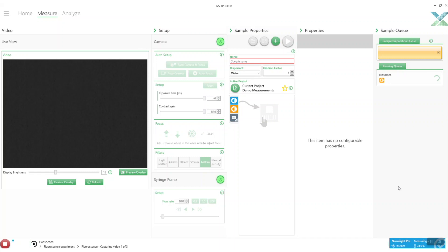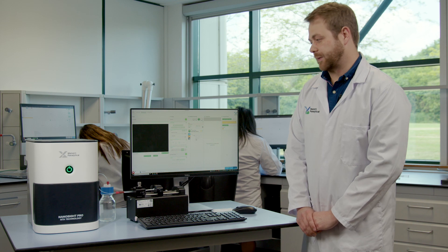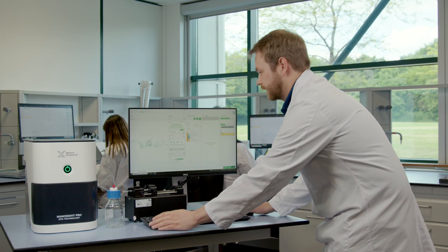Once these are both done the software automatically overlays those two parts of the measurement and makes it easy for the user. Now that measurement's finished, the processing will be happening in the background and what that means is we can either look at other data in the software that we've measured before or we can run a different sample. For sake of this we'll just be using the same one so I can just start the camera again.